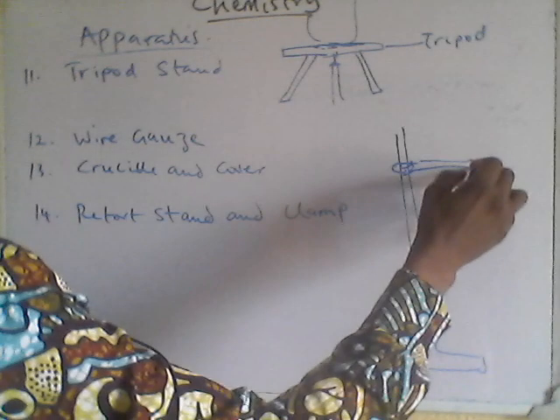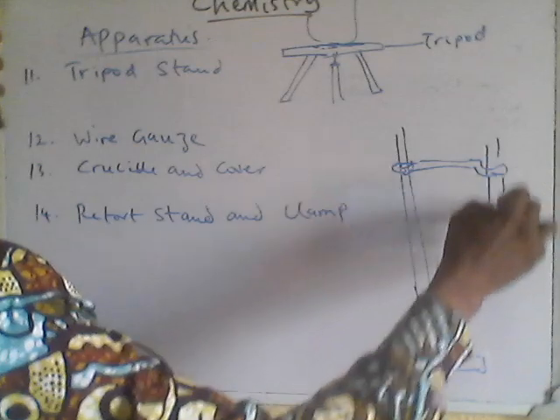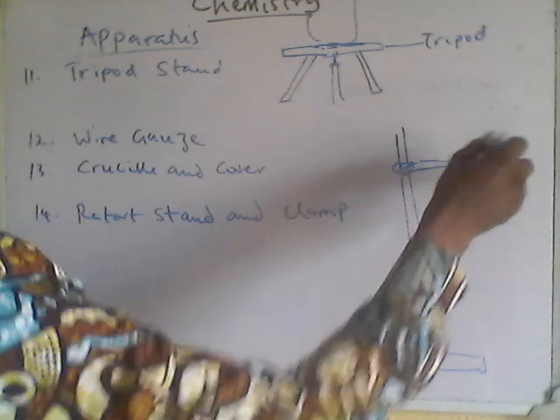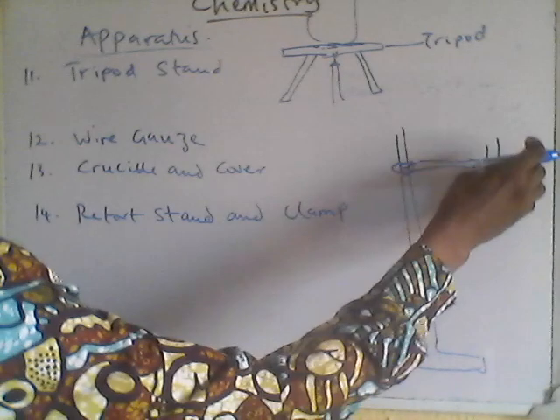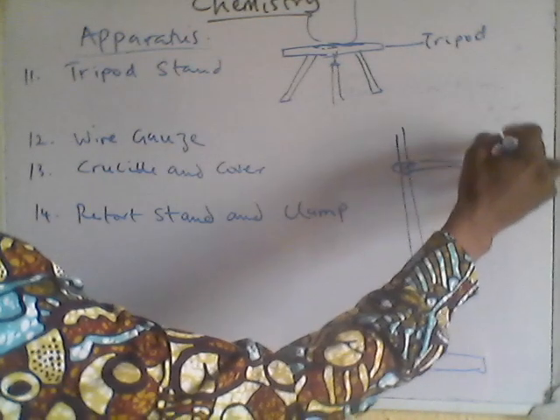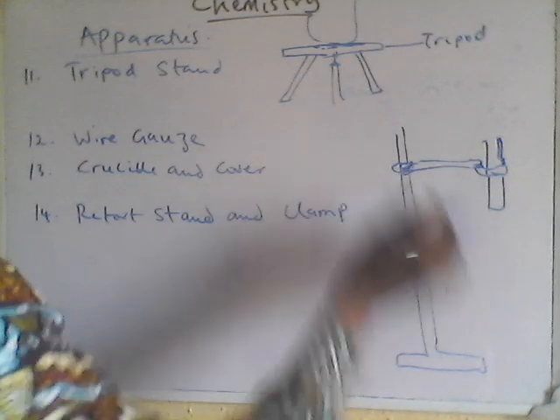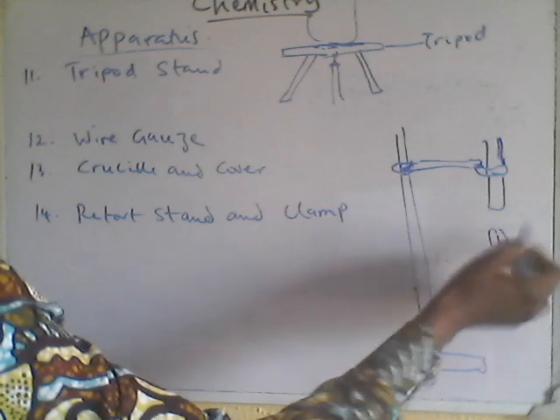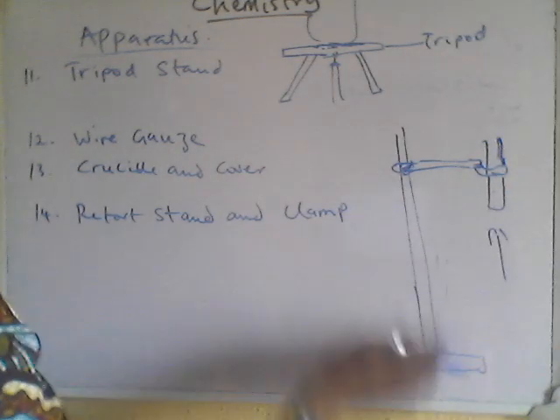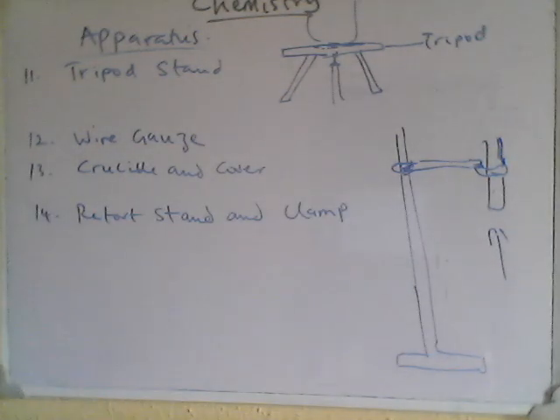It has a hand like this that can hold maybe a test tube. You tighten it here, there are 2 knobs here. Not tight enough to break it, but tight enough to just hold it. So you can hold it like this and apply heat here and observe. What it does is for support. It holds the burettes, the test tube, the flask securely in place during experiments.